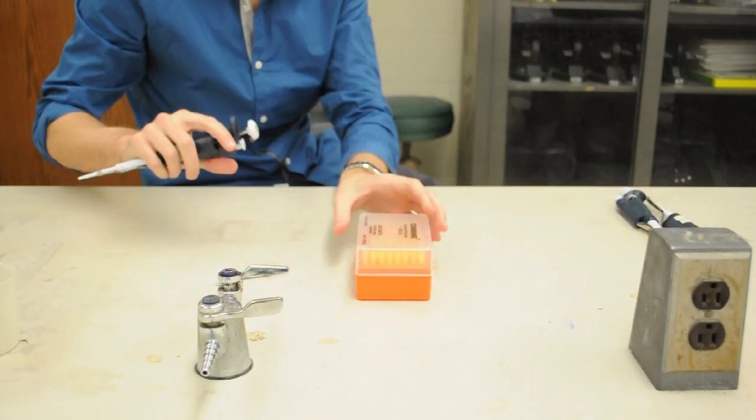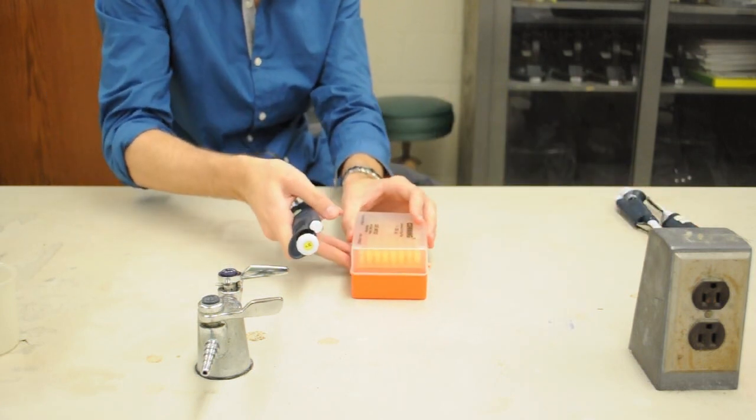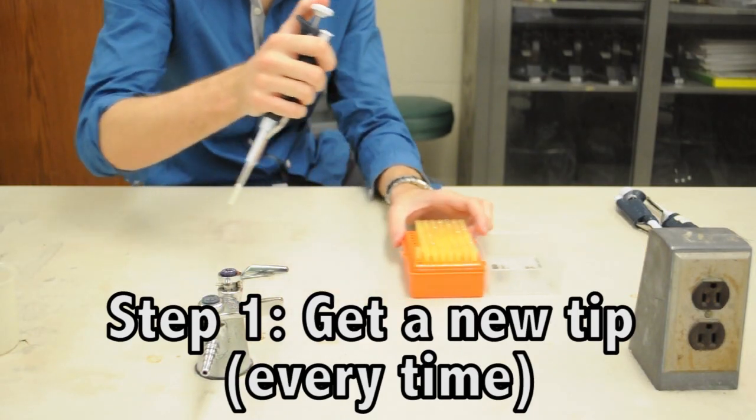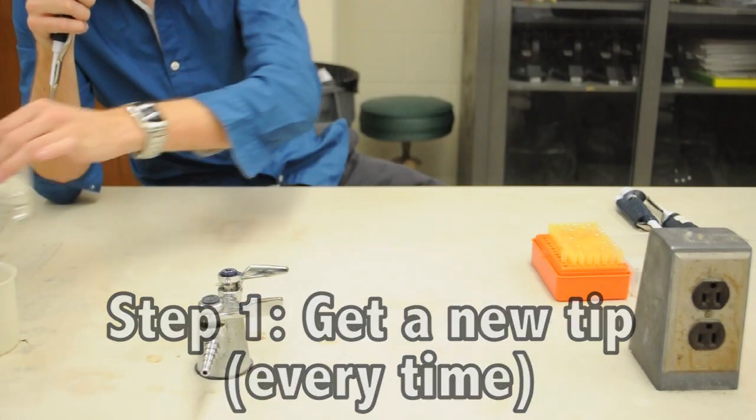Now I'll take you through the steps of actually using the micropipet. First you need to get a new tip every time you use a new substance or the tip you're using touches anything.